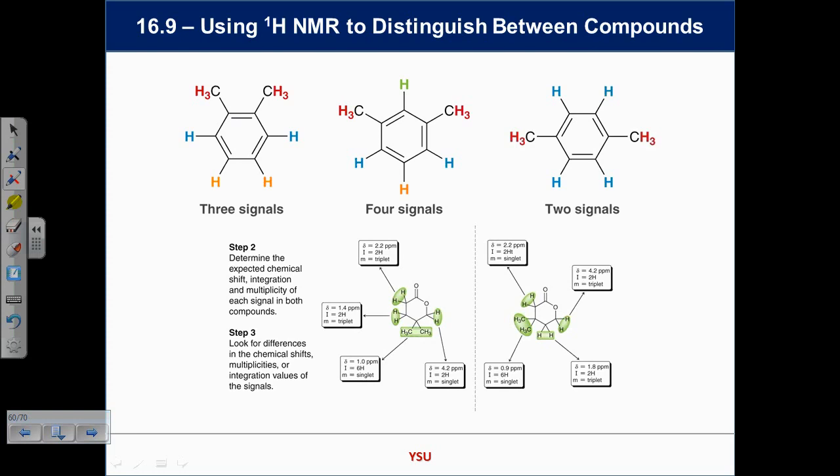and then use it. So I've got a molecule here which is symmetrical through the middle. Yeah, left matches right, and I can fold it in half and it's the same thing. So I have obviously the two types of benzyl protons. They're equivalent, so you just need one signal. And then down here we've got blue, and they're equivalent because they're the same across that symmetry line, and then those two down there. So that's 3. Now look at the next one. We change this from a 1,2. I might as well get this out of the way now.